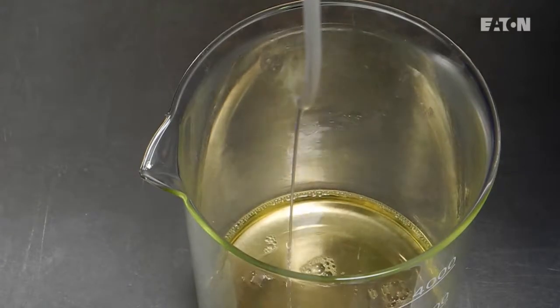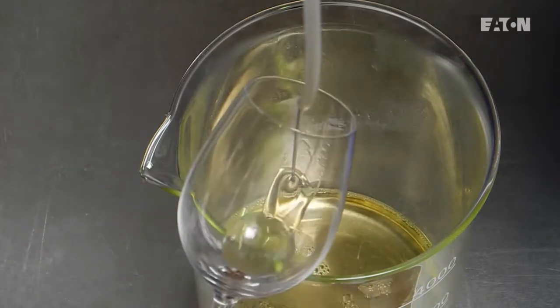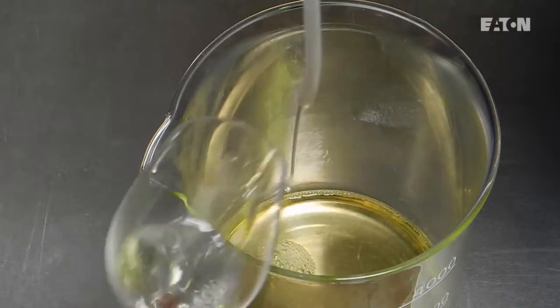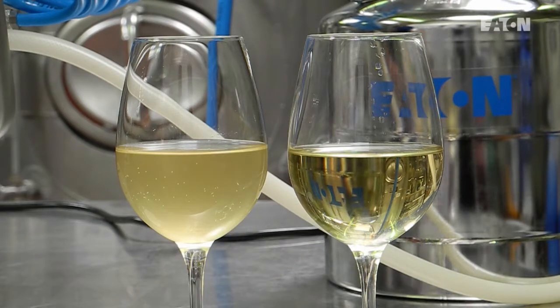We have started the system right now. As you can see, the wine is going through, and we can take a sample to see how fast and how clear the wine comes out. Here we have the unfiltered wine from the storage tank, and here the filtered wine after the Beko PET 450.